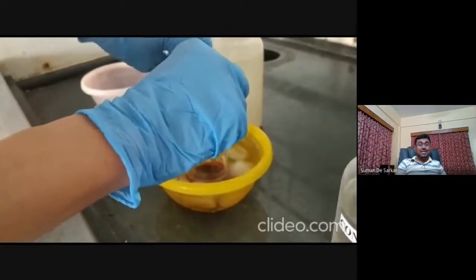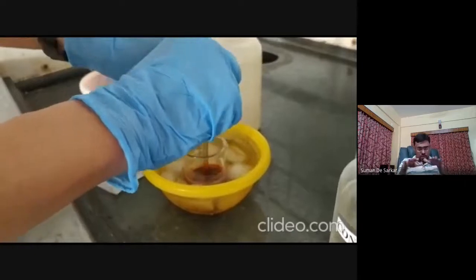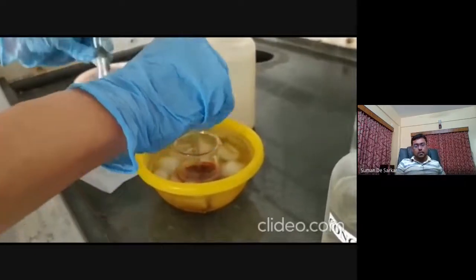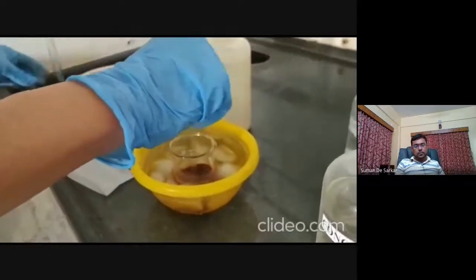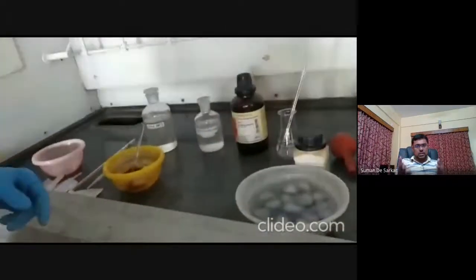And because now it's an acidic solution, right? We added HCl. The solution is acidic. That's why it's red. Reaction for 15 minutes. Yeah. The pH is acidic.